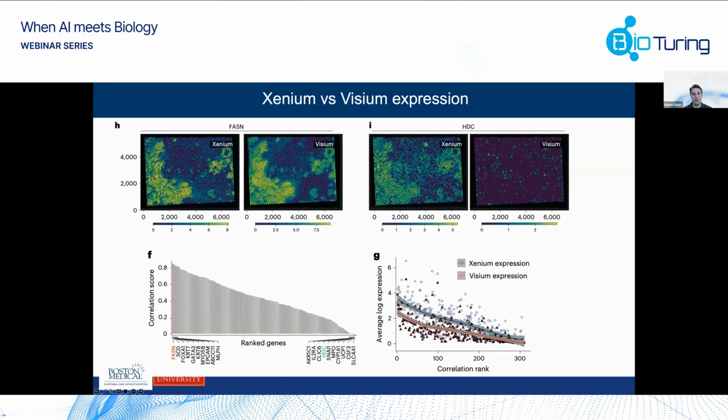You can do the same idea with Xenium and Visium if you have that data and if it's aligned. So here we can do a little trick. We can use our very flexible spatial unit development, including making all types of bins and hexagons. And we can create a pseudo Visium from the Xenium. So we can bin the Xenium the same way as the Visium, and so you can make a direct head-to-head comparison: this is what we see in Xenium, this is what we see in Visium.